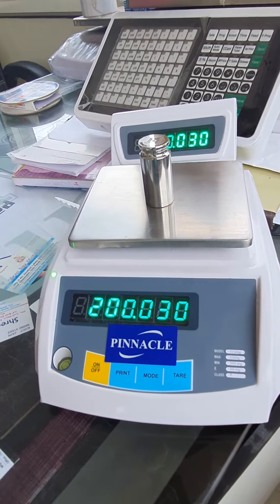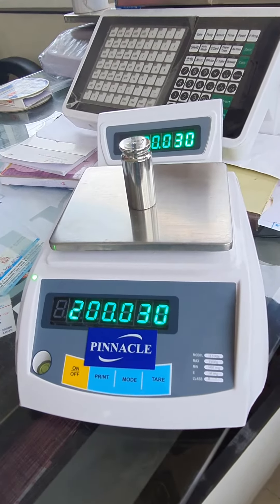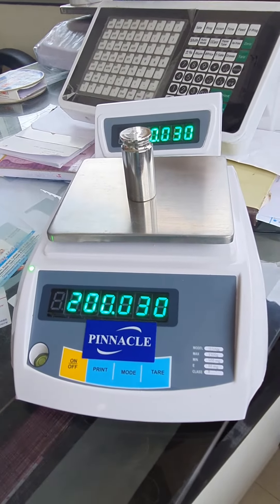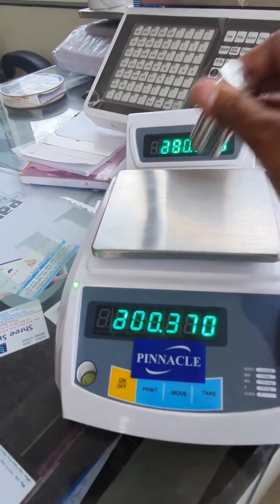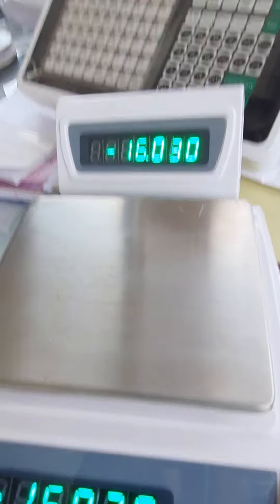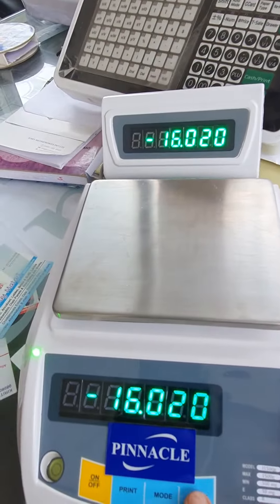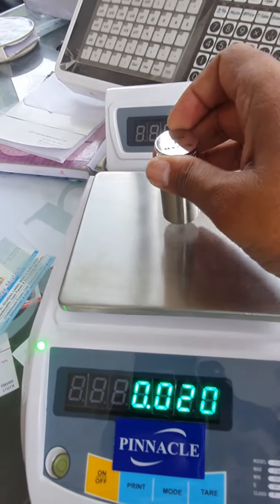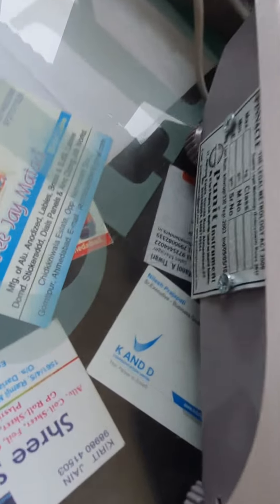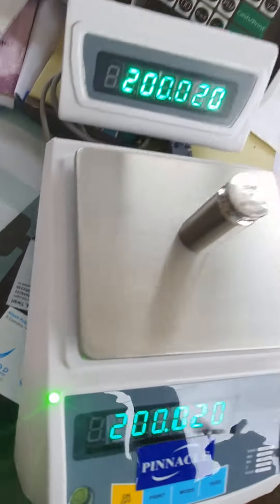This analytical weighing scale has a capacity of 1500 grams and an accuracy of 10 milligrams. You can see the square plate so that you can better check it. This is the government stamping place.